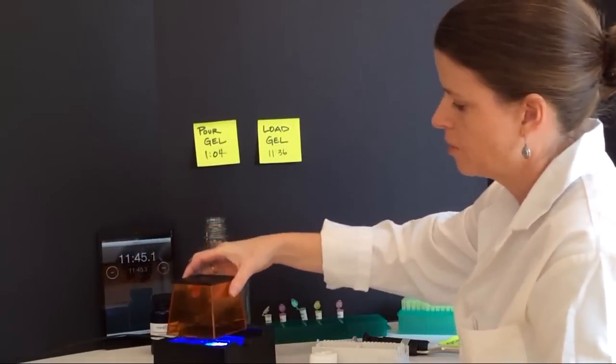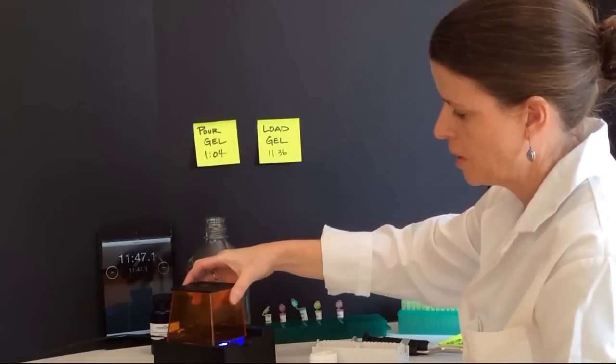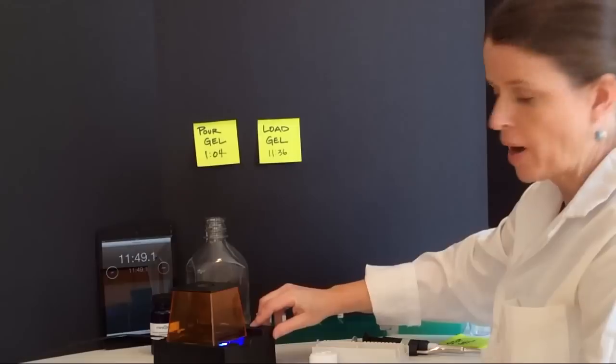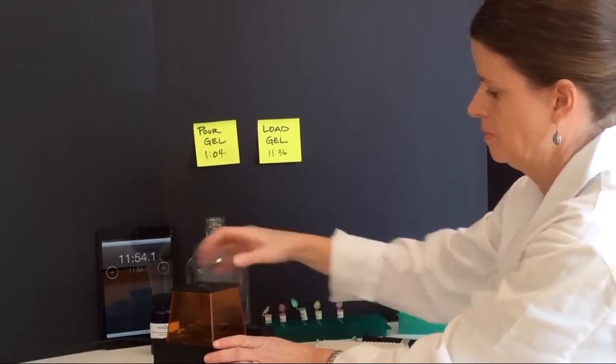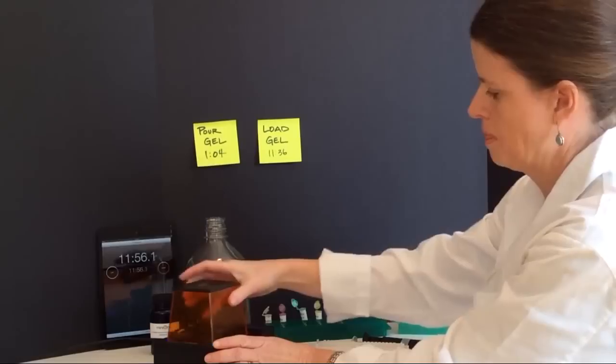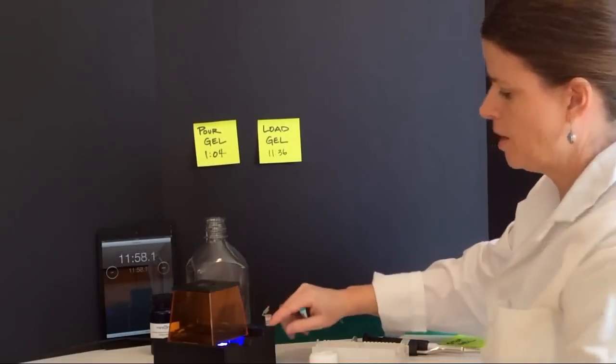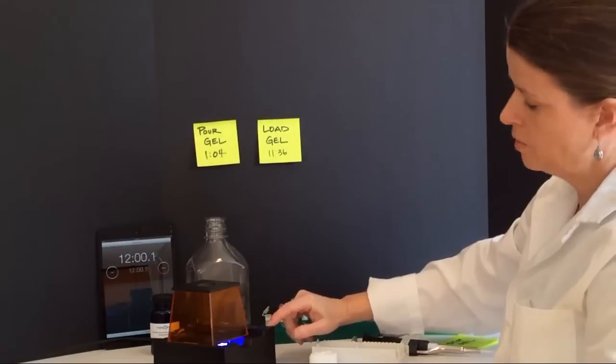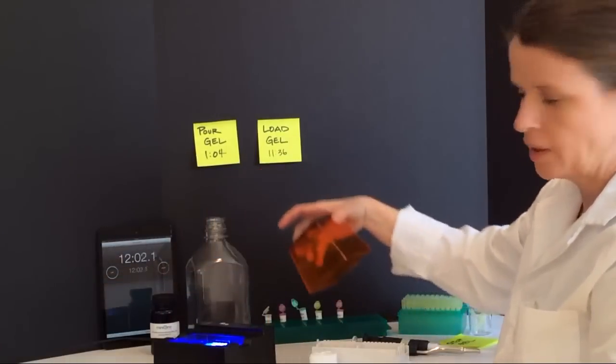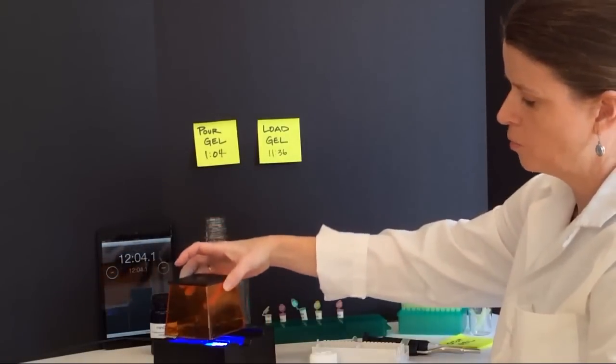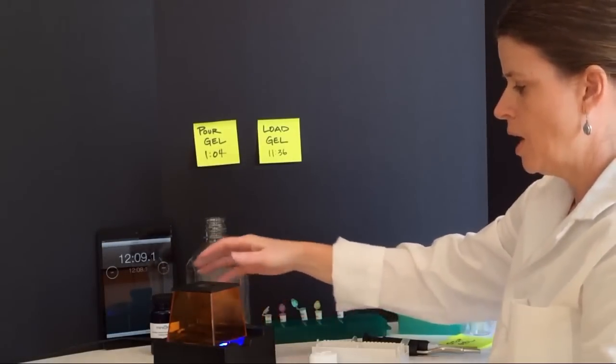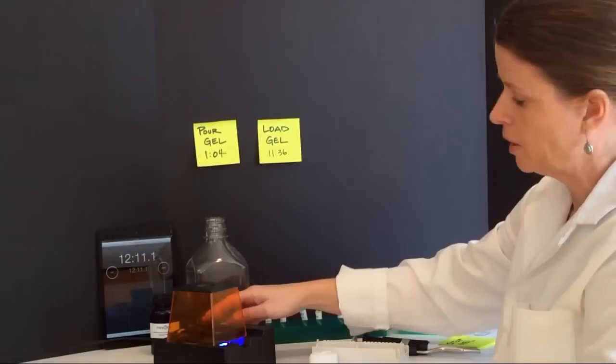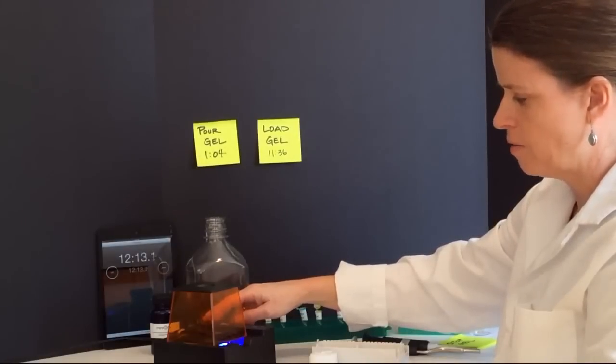At this point, I'm ready to start running my gel. I'm going to place the top on my gel box and press the power button. Once I've done that, I'll see a green light come on. You'll notice that if I remove my top, the green light will go off because my power will no longer be running. So this is another nice safety feature.